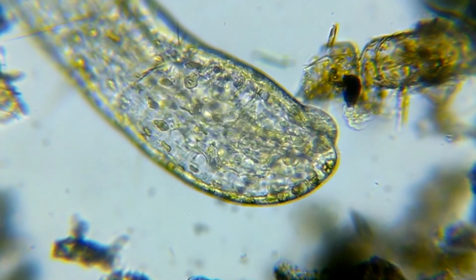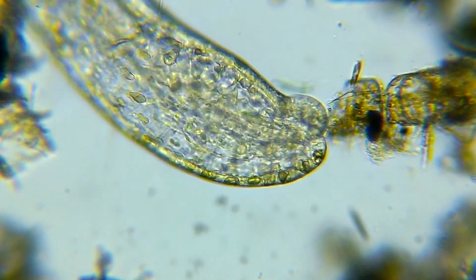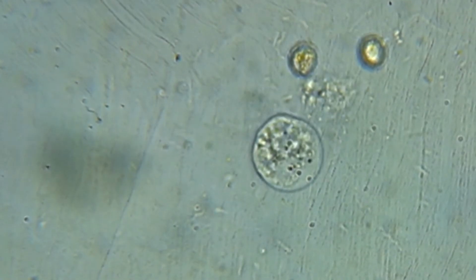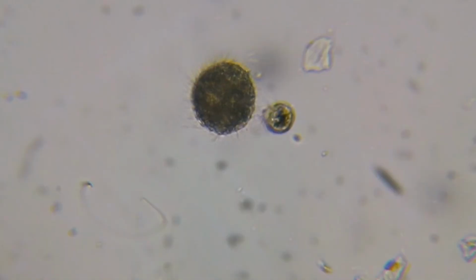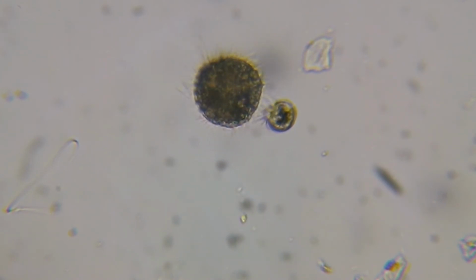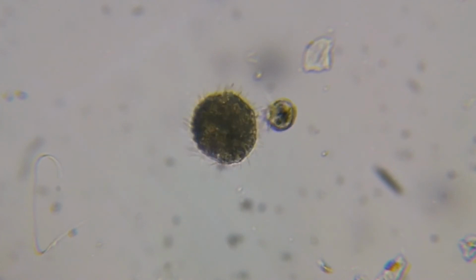He's pretty cool. Another worm. Seemingly got some suction going on there. Some kind of flatworm. You can see cilia all along his body. That guy. And then this little guy. It's like when a bug falls over on their back, and they just keep walking with like a clump of dirt on their feet. I thought that was pretty good.